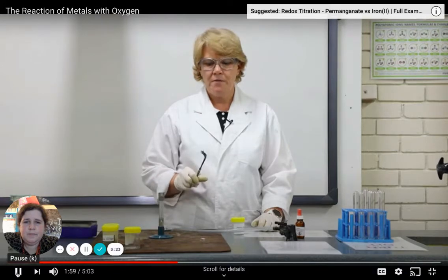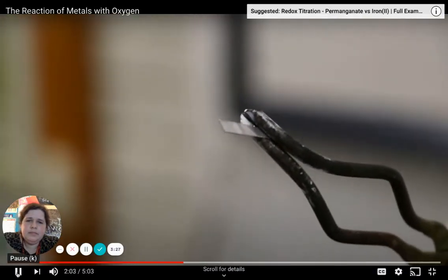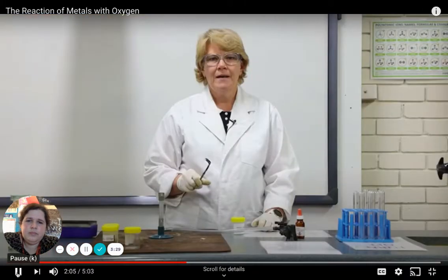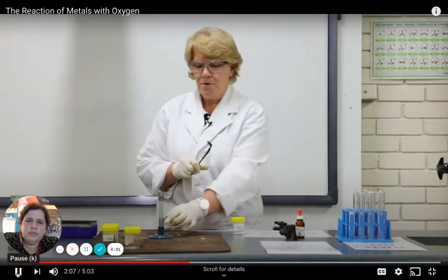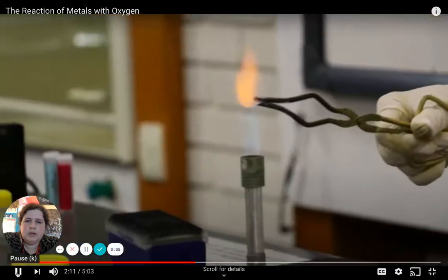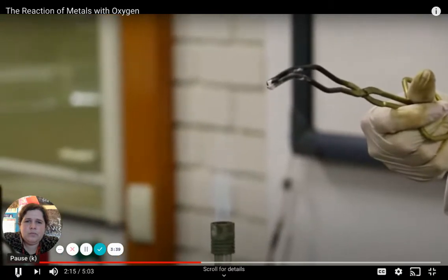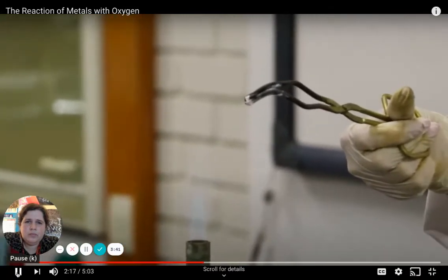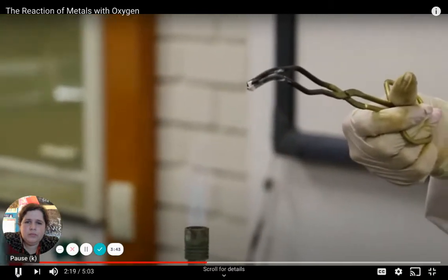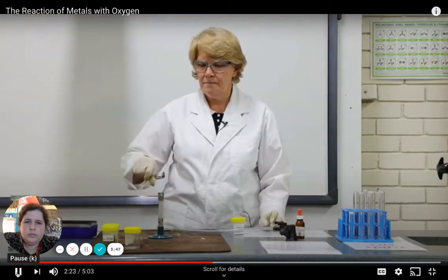I have a piece of aluminium. It's a shiny grey colour. Can you see how shiny it is? Let's put it into the Bunsen burner flame. So she's putting basically tin foil or aluminum foil in there. We can see immediately that it is melting in the Bunsen burner flame. Just going to try and heat it as much as I can.